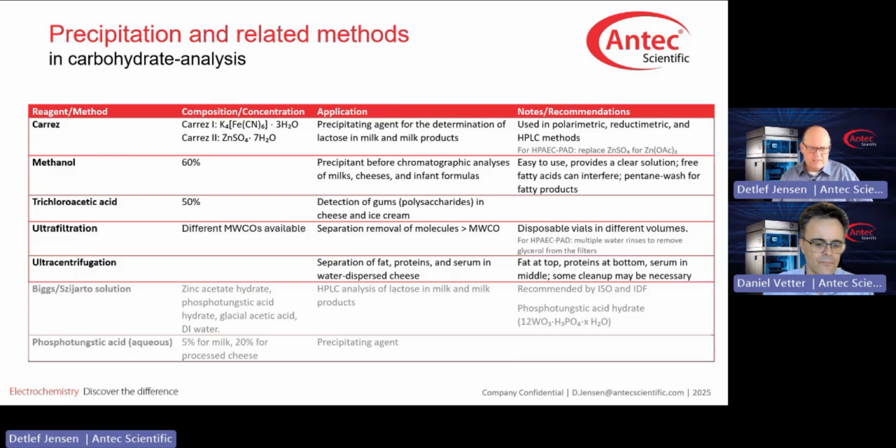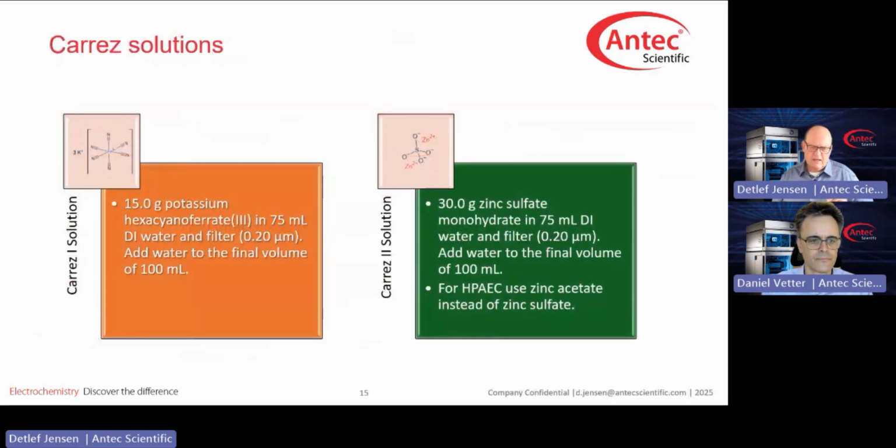So trichloroacetic acid, that's not much to say, they're very standard. And then we have ultrafiltration and ultracentrifugation. And I have to admit, I am a big fan of ultrafiltration, and that's why we are going to talk a little bit about ultrafiltration on one of the next slides. Now, whatever you do, you have to keep an eye on the consequences. And as I said, there is a consequence when you use zinc sulfate for Carrez. Let us have a closer look at the consequences.